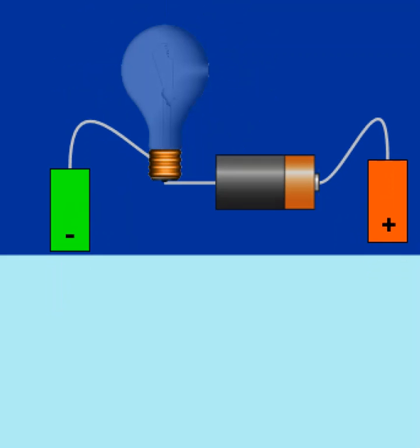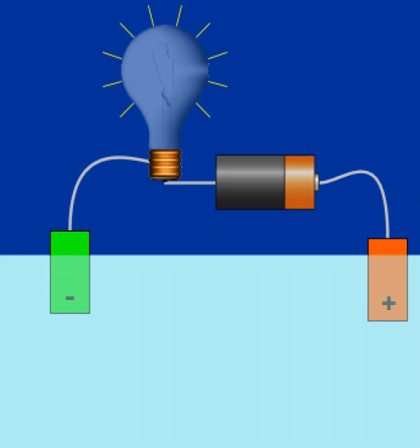Okay, I have my 0.1 molar hydrochloric acid in there. Let's see what that is. So it's a lower concentration, but it is something that forms ions. So this is like a medium light. Again, we have ions in solution, but not super concentrated, not as much.